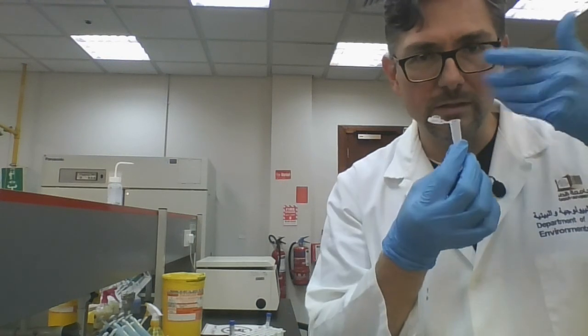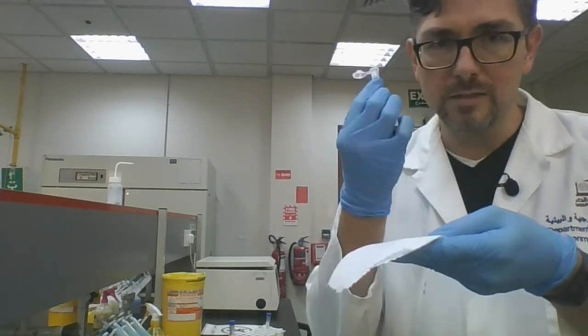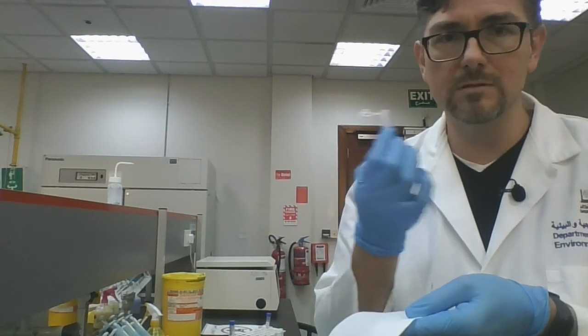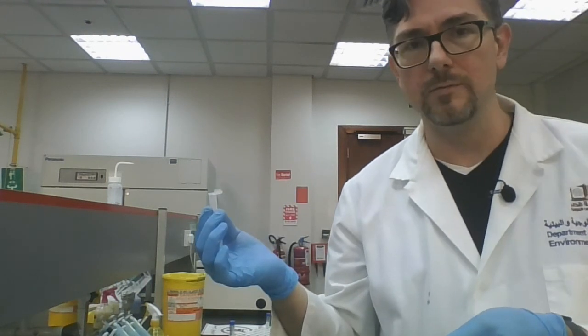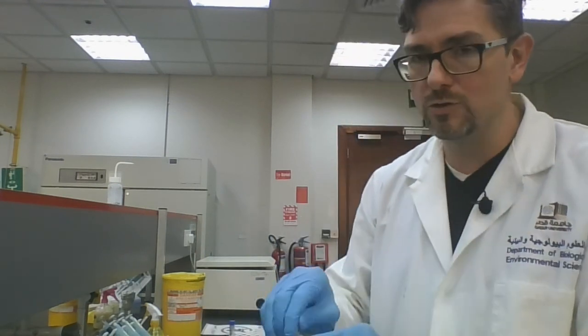Don't do the chemistry thing. This will not do anything for you. Just smell it. Don't cough into it. Don't breathe into it. You don't want to be adding enzymes to this. Just sniff it. If it doesn't smell like ethanol, it's dry. You can go ahead and do the next step, which is adding TE or TER. Okay? So I'm going to do this with the other one, and then we're done. So about a 10-minute incubation just to dry it out.